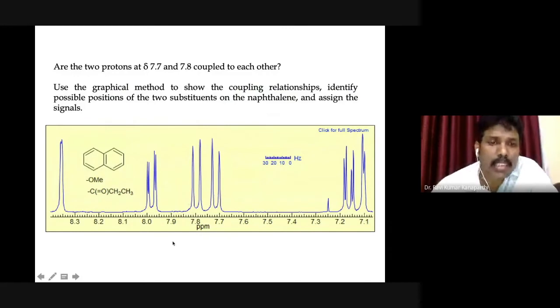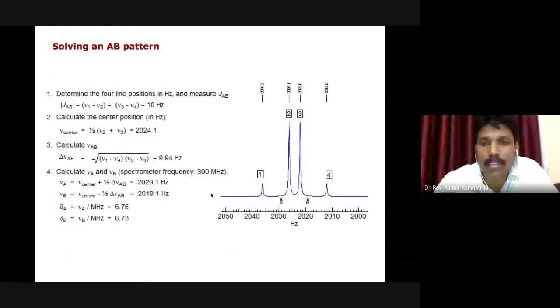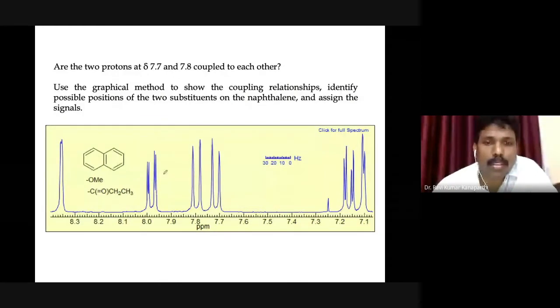These are examples of different molecules that you come across, and this is a real example. You may ask me, sir, this is a graphical thing, right? These are all graphically drawn by me, but there are real molecules that give this type of pattern. Now the question is, how do you represent this value in the NMR spectral data? How do you do that? Similarly, for this value, how do you do that?